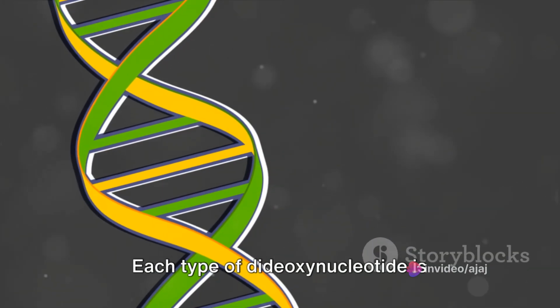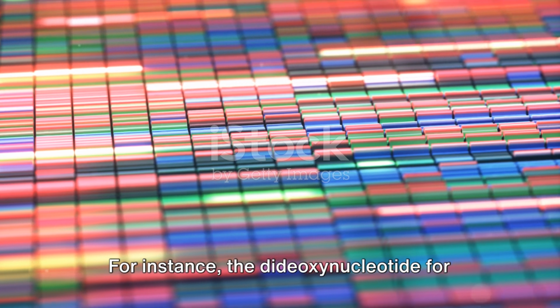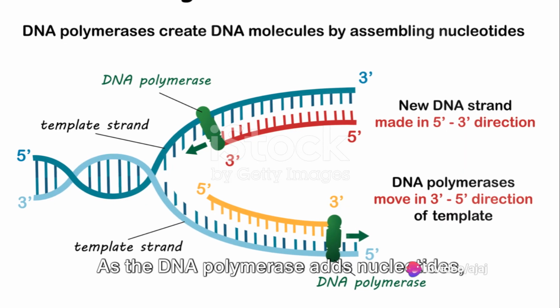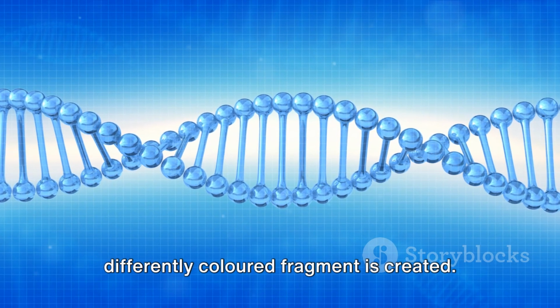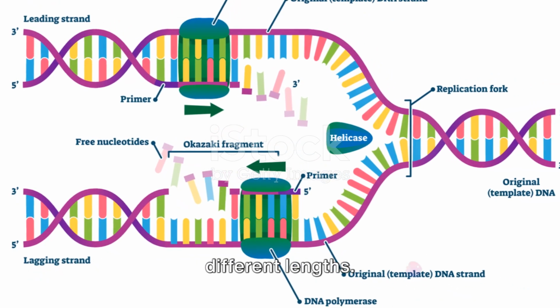Each type of dideoxynucleotide is labeled with a different color. For instance, the dideoxynucleotide for adenine might be green, while that for thymine might be red. As the DNA polymerase adds nucleotides, each time a dideoxynucleotide is added, a differently colored fragment is created. This process creates many fragments of different lengths.